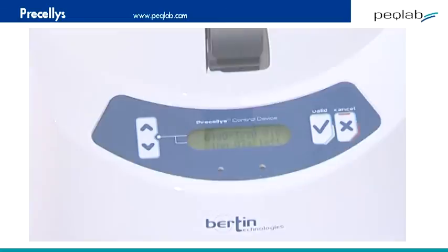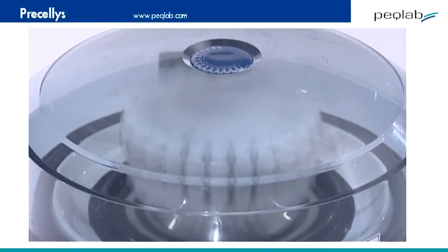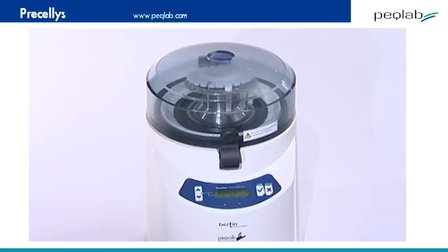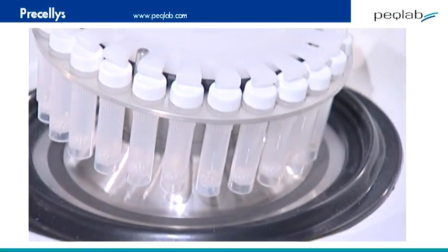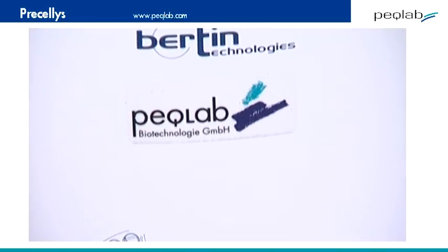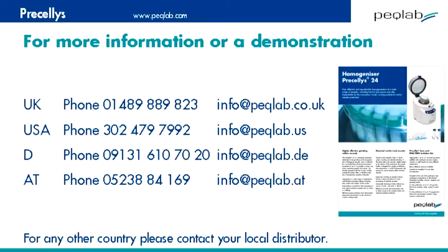In summary, the Precellys is an extremely well-designed benchtop system designed to aid sample recovery by high-energy homogenisation. It is available with optimised beads and downstream purification kits from peqlab. The system is available for demonstration in your lab — contact peqlab at info@peqlab.co.uk or visit www.peqlab.co.uk.